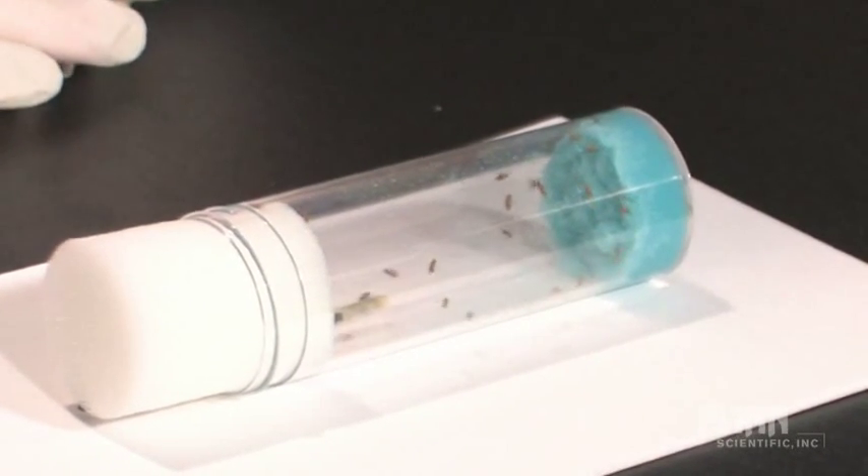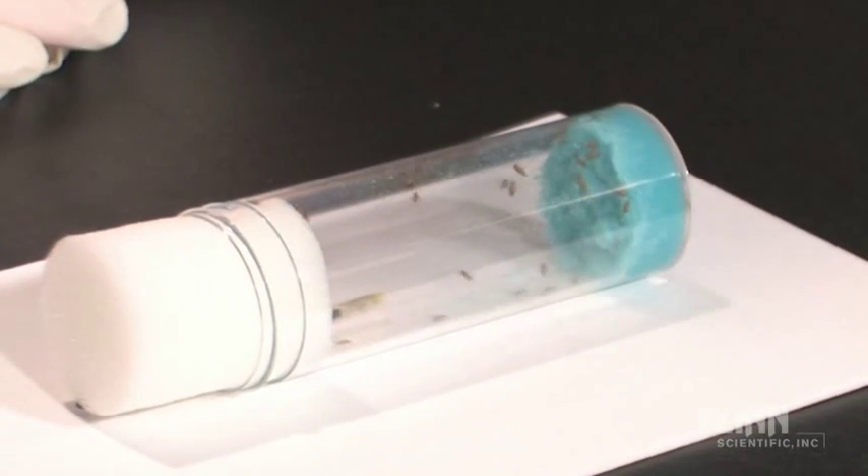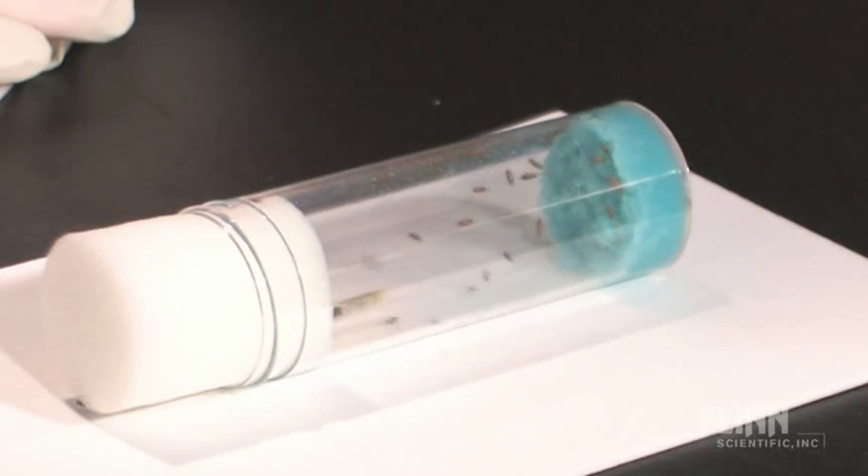Exercise caution not to touch the foam of the wand containing lullifly to the foam plug. The lullifly will absorb into the foam and cause the flies to become over-anesthetized, resulting in death.